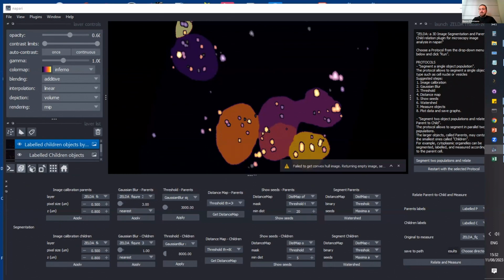Second question, yes, you can add points as well to the segmentation, and this is great because I want to be very humble. What I've done is just connect things that exist already, using this amazing viewer, which is Napari. Napari gives you the possibility to add points. We have seen this yesterday in the lesson that Juan made. So adding more points will give more seeds for the watershed segmentation. And we can apply a filter after the segmentation, but the result we will get will be slightly different.